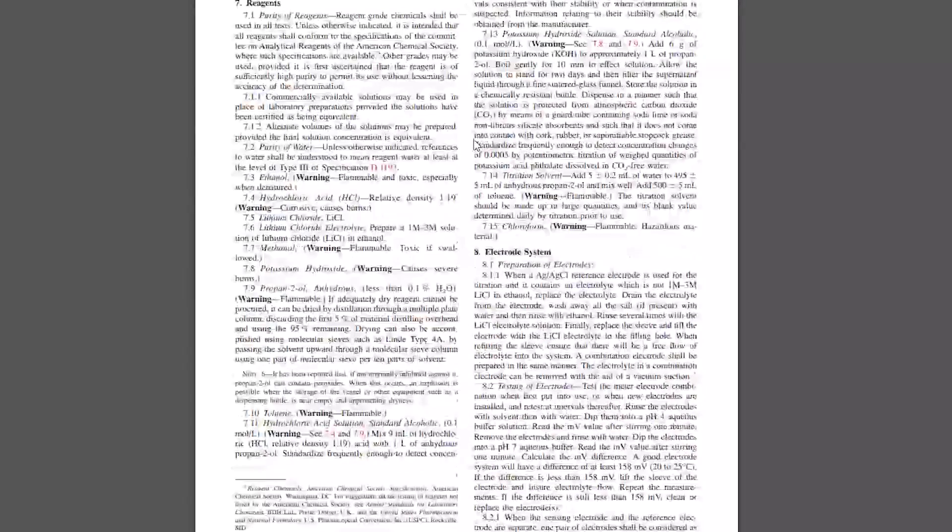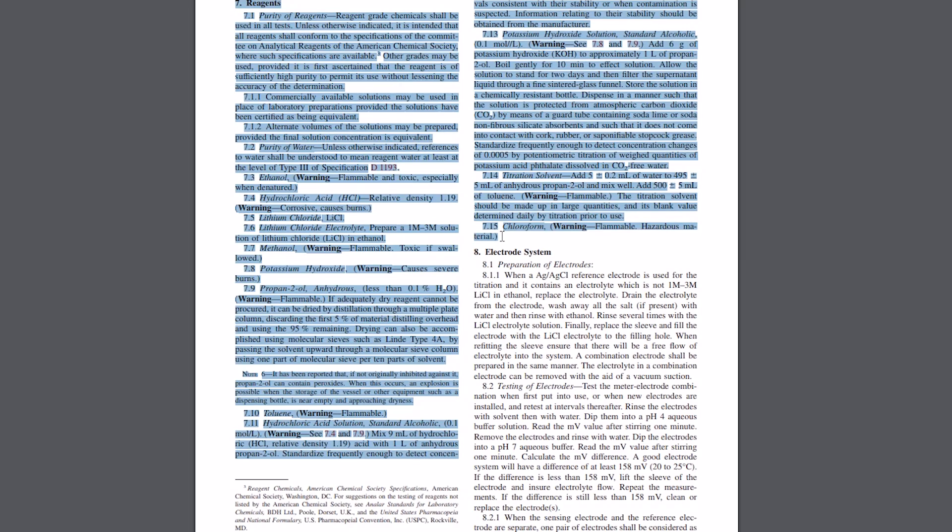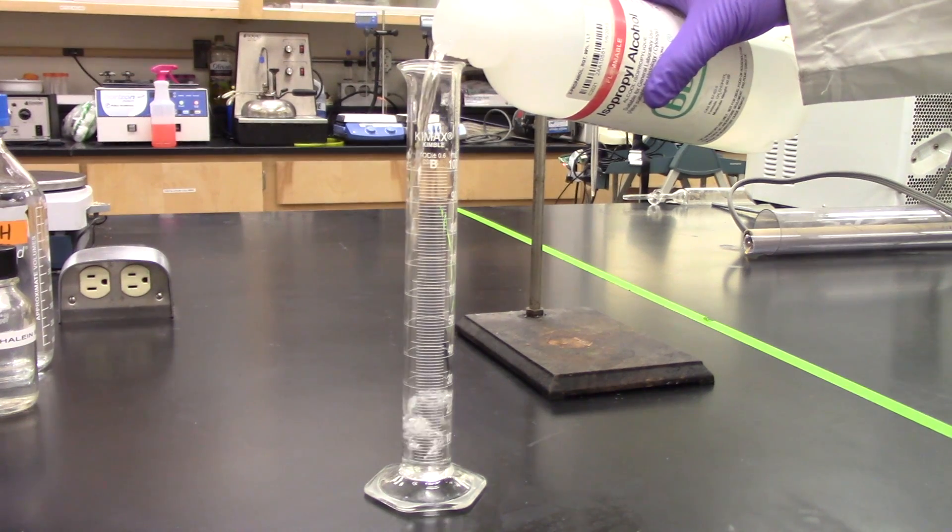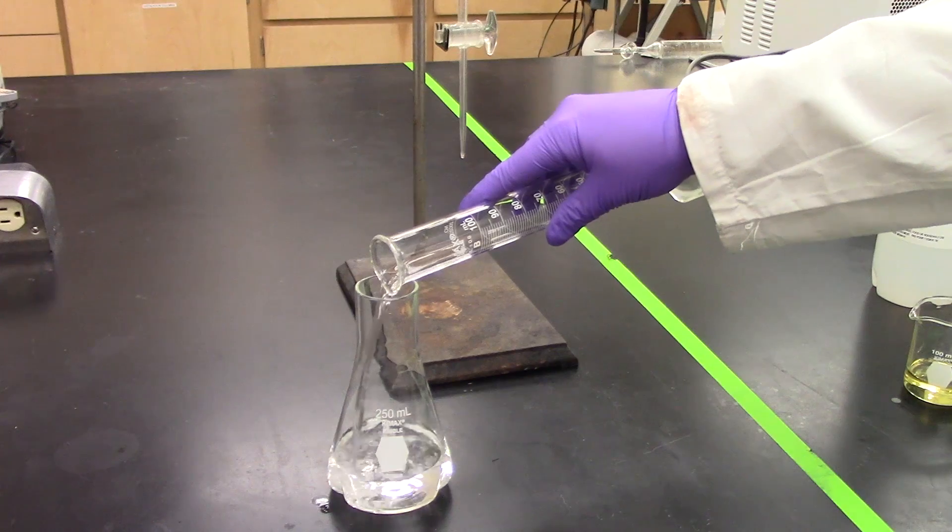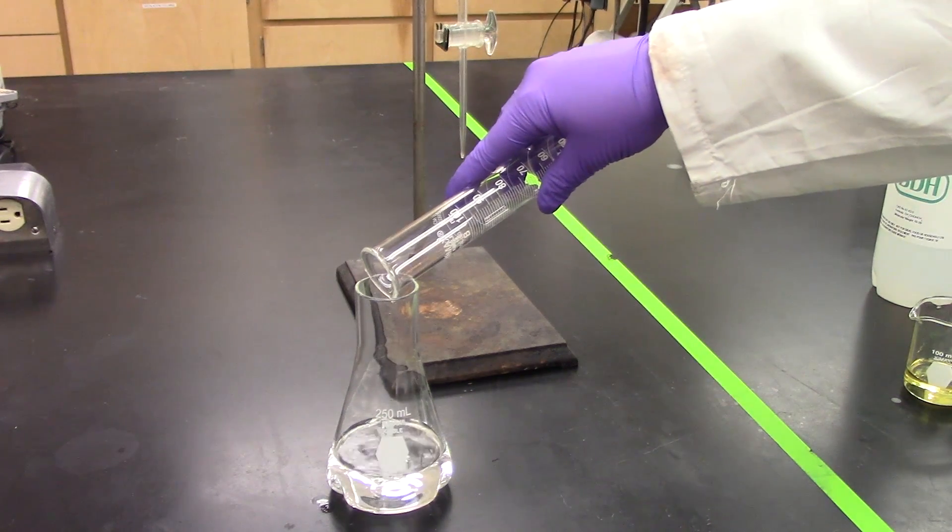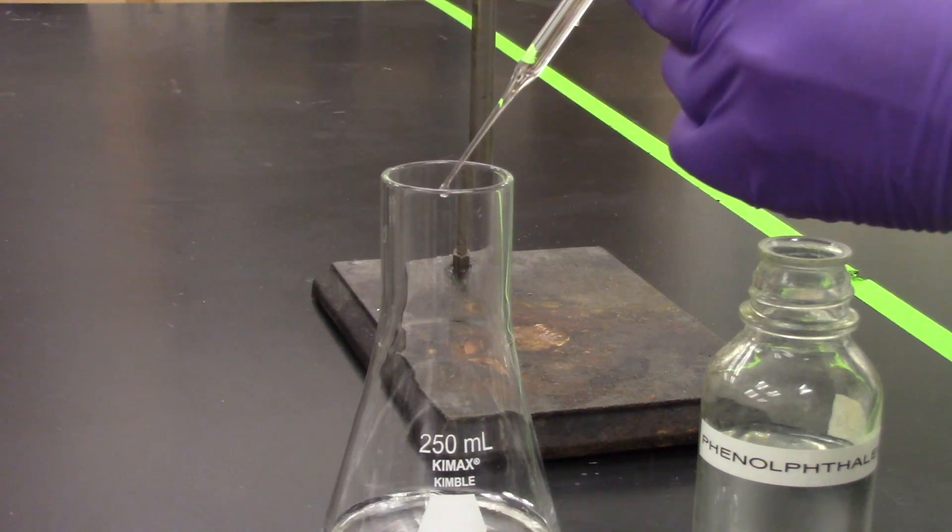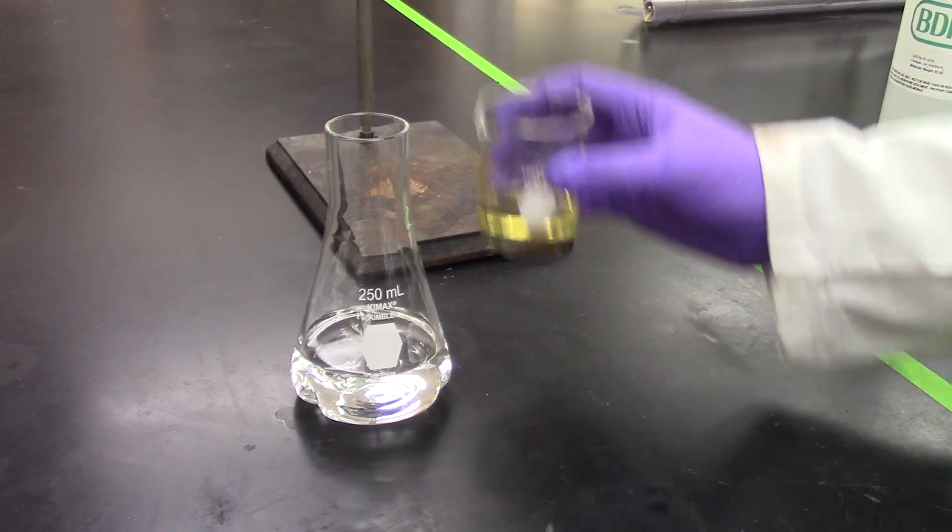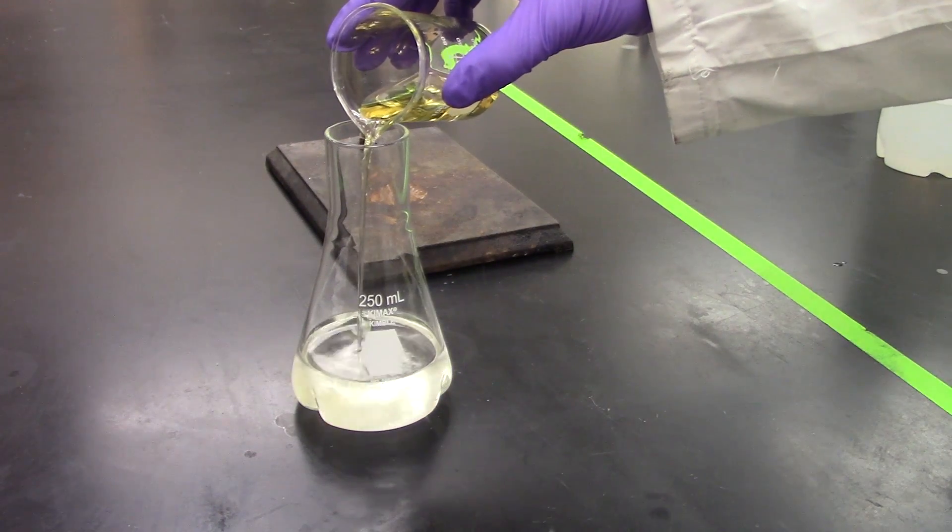Instructions for standardizing the titrant are found in ASTM D664. Start the procedure by adding 100 milliliters of the titration solvent to a 250 milliliter Erlenmeyer flask. Add approximately 10 drops of phenolphthalein indicator solution. Pour a weighed sample of approximately 20 grams into the solvent.